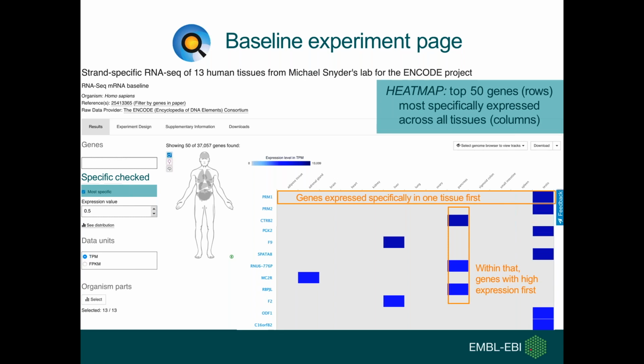Genes are ranked first by specificity, i.e. specifically expressed in an individual tissue, and then by expression level. This most specific view is highlighted in the green box, and this is the default view for a dataset.